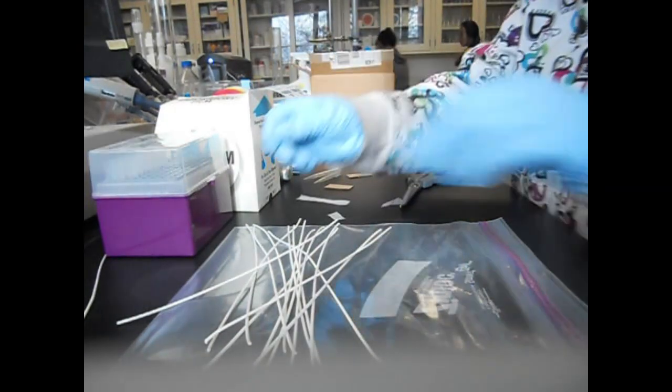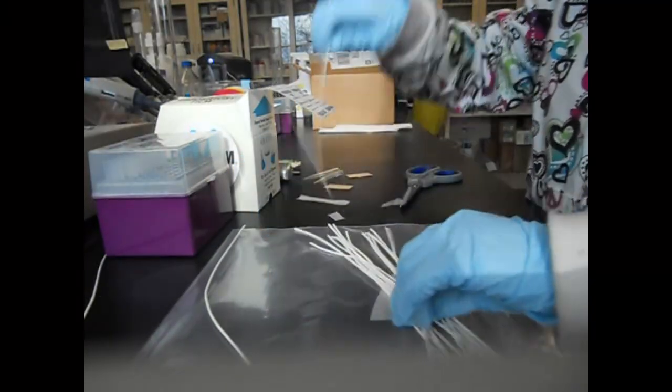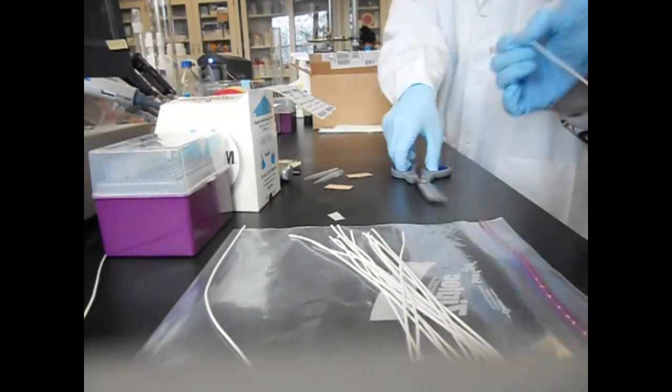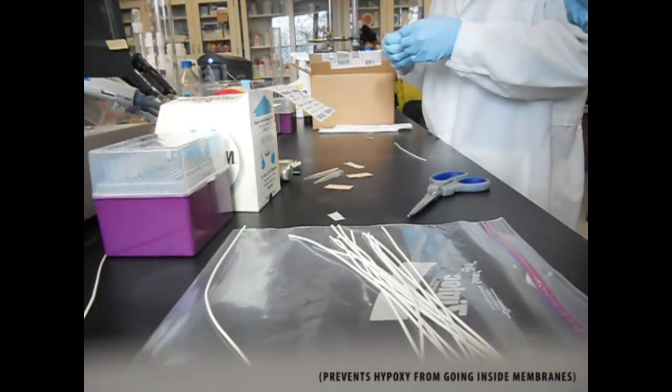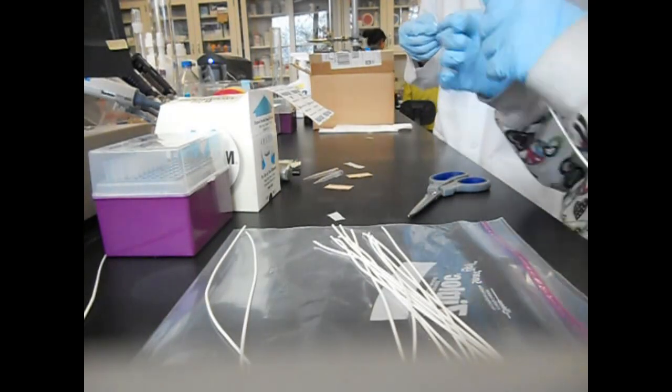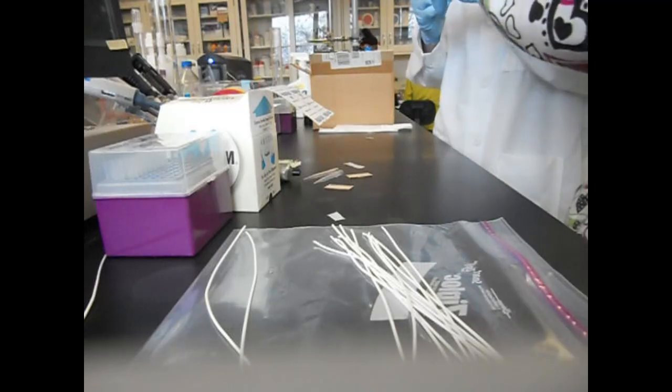Then do the same thing on the rest. It will prevent the epoxy from going inside the membranes when you glue it. Otherwise, it will block the hollow inside.